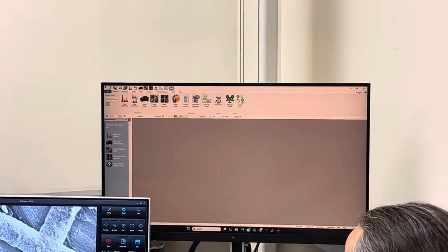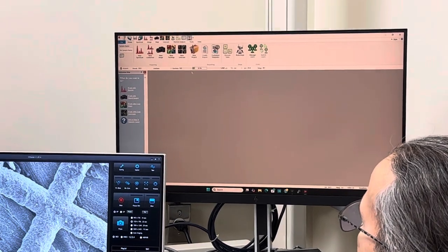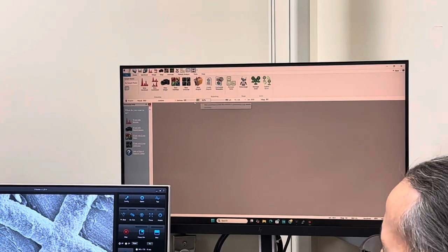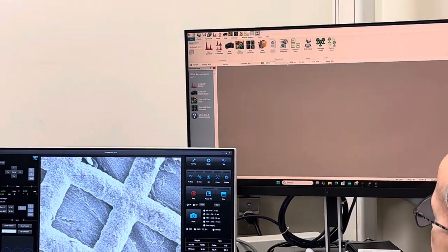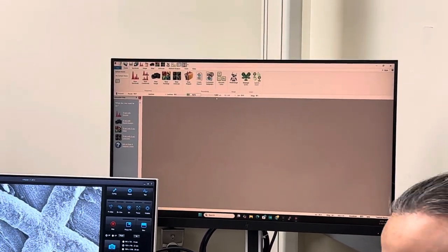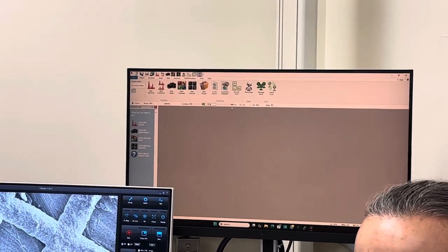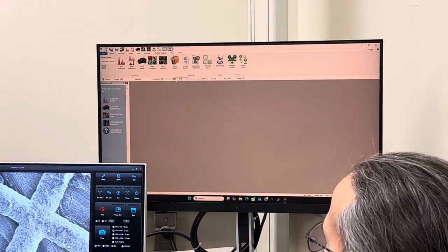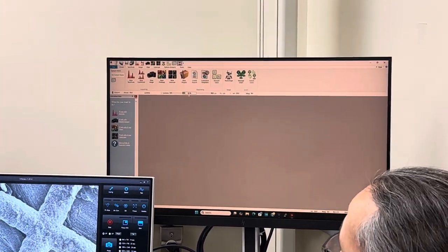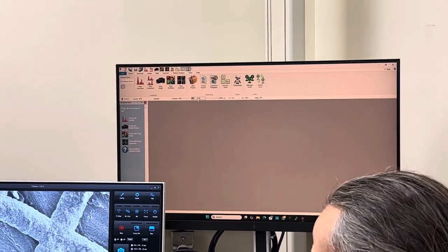this CPS that we had down here, this little display, corresponds with this right up here. See where it says C-S? And C gives me a percentage there? So right now I'm seeing roughly 800 to 1,000 counts per second, and that fluctuates, it's normal. So every second there's 1,000 X-ray events hitting the detector. And of those 1,000 events, 15% aren't being processed. That scale right there is referred to as dead time. So that'd be 15% dead time, 16% dead time. It's an equation, it's okay.